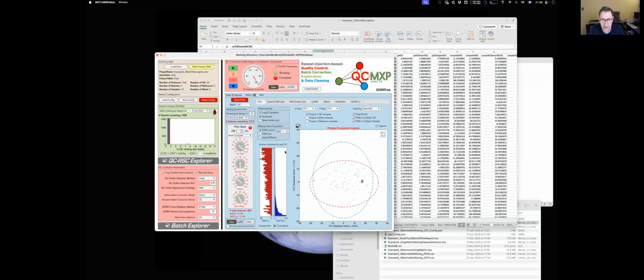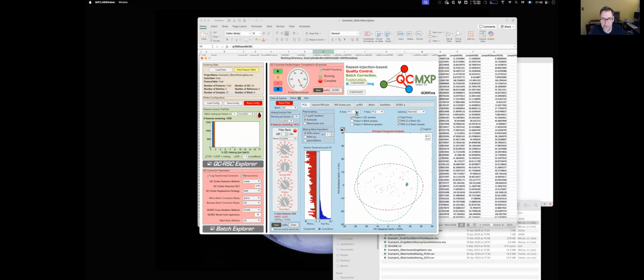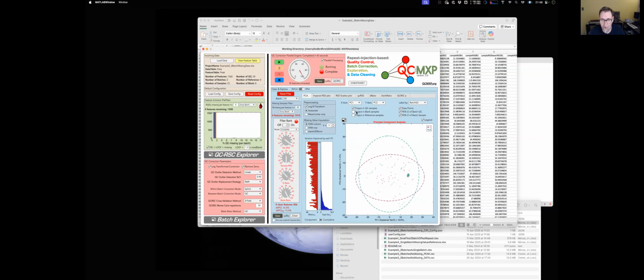I'm looking at my clock now, and I feel like if I don't stop now, then there won't really be much time for questions. So I hope that's given you a very brief overview of, I know there's a lot of detail here, there's a lot to cover. Like I said, the webpage is quite useful, but it really is one of those, it's been designed with the idea of to play with it and learn by using it, hence the very graphical, interactive nature. So hopefully it's fairly straightforward for people, but I'm happy to take any questions.